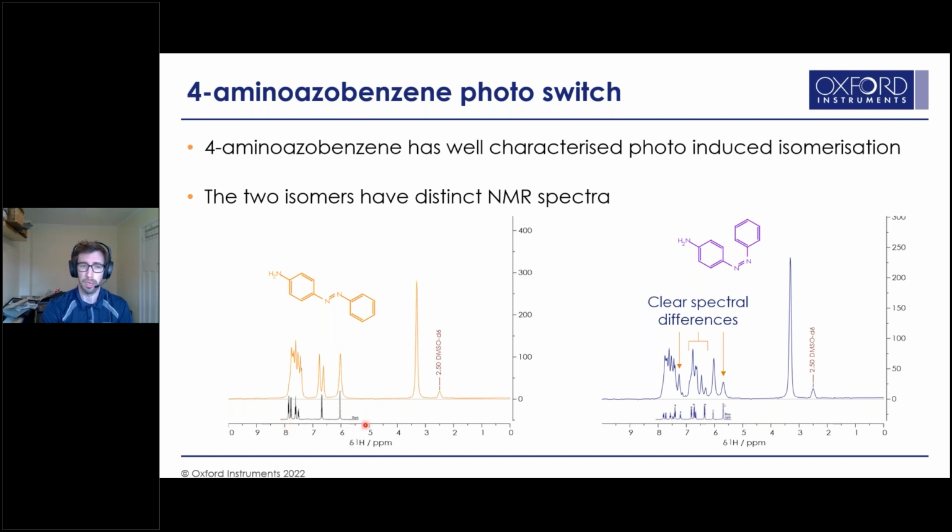If we look at the high field spectra that Sasha showed in relation to the benchtop spectra, we can see that obviously, due to the lower field, we get less dispersion in the spectrum. However, we are able to very, very easily see the difference between those two isomers. So the trans isomer on the left here, we see not necessarily as well resolved to the baseline, especially in this group here, but actually we see very clear and distinct peaks.